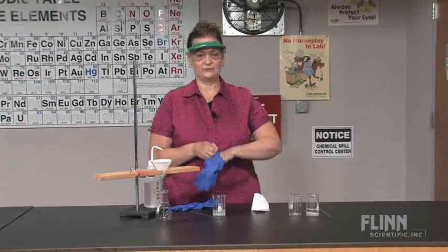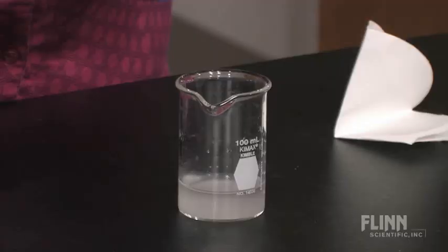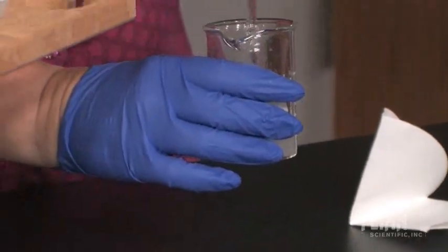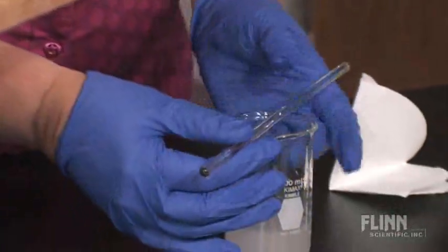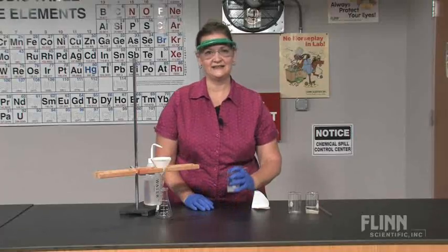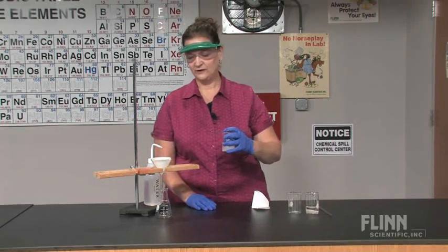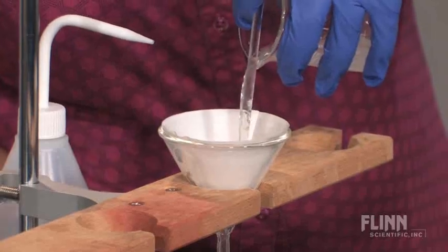I've already got this one prepared. You want to make sure your mixture is well stirred. Then place the stirring rod across the top of the beaker at the lip to help guide the flow of liquid. Holding that stirring rod in place, you're going to pour the mixture into the funnel.